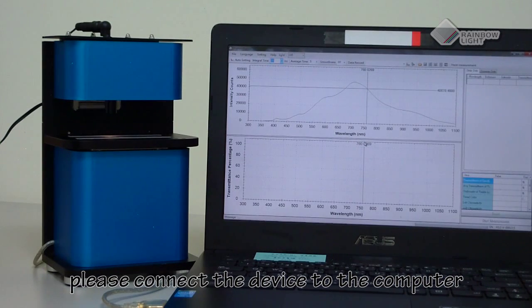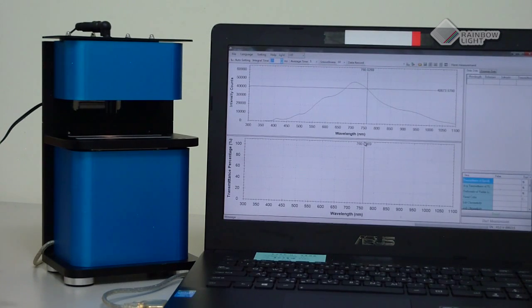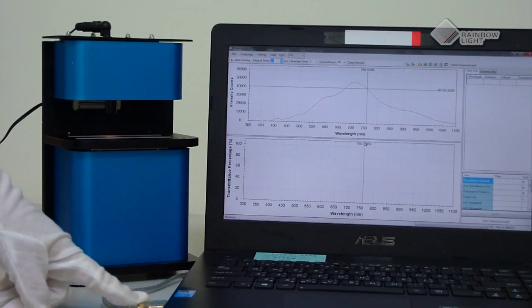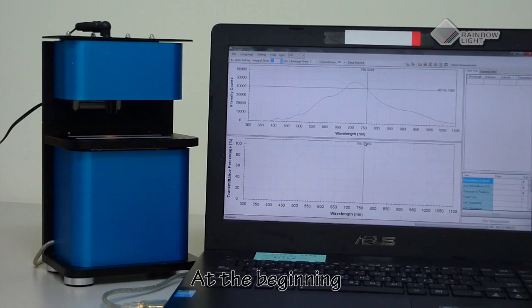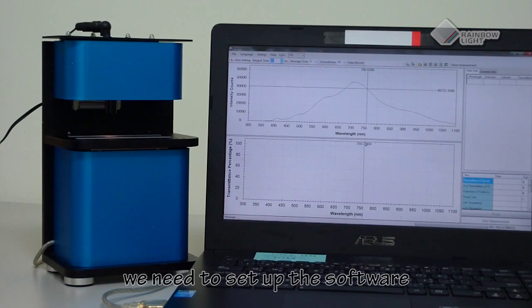Please connect the device to the computer. At the beginning, we need to set up the software.